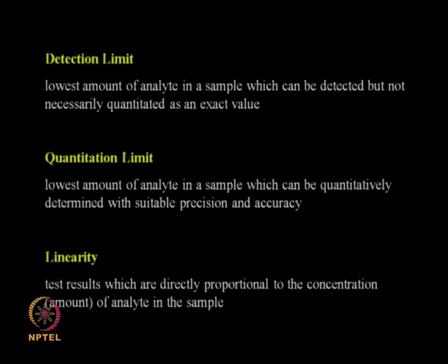Then we have the linearity, as I talked about in the standard graphs. The response and the concentration of the solute should be linearly related, then only we can develop a linear regression relation between the concentration and the response. We do not like to operate in the non-linear range. So what is the linearity range? That is very important, and if your concentrations are very high, you may like to dilute it so that you operate within the linear range. Generally we would like to operate in the linear range with analyte concentration versus the response.